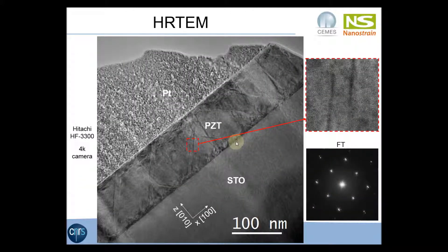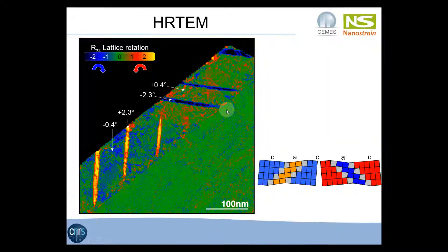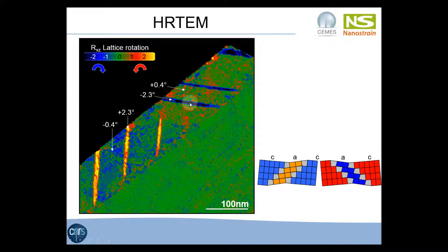This is another high-resolution image with a large field of view — thanks to a 4K camera, we can achieve a field of view of about 400 nanometers while still having enough pixels to sample the largest lattice planes. Several A domains with two different inclinations are visible: on the left part of the image the A domains are inclined to the right, and on the right part they are inclined to the left. This is a map of the rotation calculated by geometrical phase analysis, where anticlockwise rotation is positive and corresponds to red and yellow colors. On the left part, the A domains are rotated anticlockwise, and on the right part they are rotated clockwise.